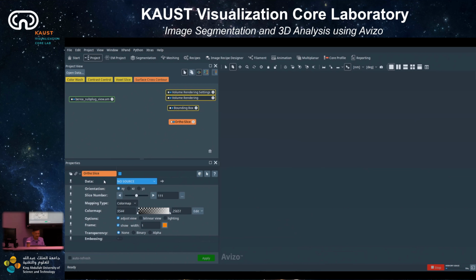If you click on the data drop-down menu, you can see a list of available data to be attached to. So you can just select here to connect, or you can click on the little white box, select data, and you get the string attached to it. Either way, choose. If you select from the data port in the properties and choose from the drop-down menu, and you have only one or two data sets open, it will be okay. You can find it easily.